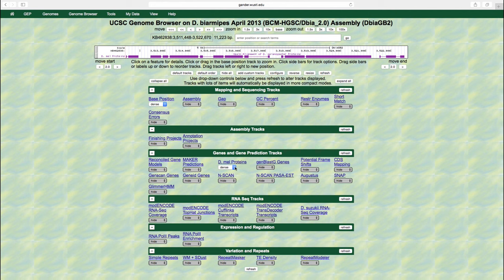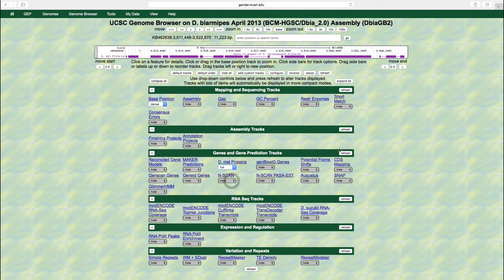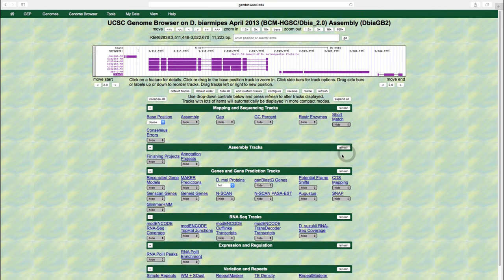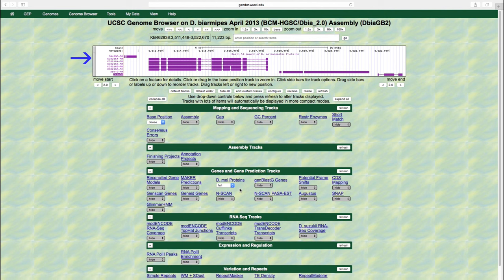Let's now change the display mode for the DML proteins track to full. We see that there are many more features in the DML proteins section of the genome browser image. That is because the full display option shows each annotation feature on a separate line. Because this display mode may result in an overwhelming number of items, it should only be used when you are examining a small genomic region.